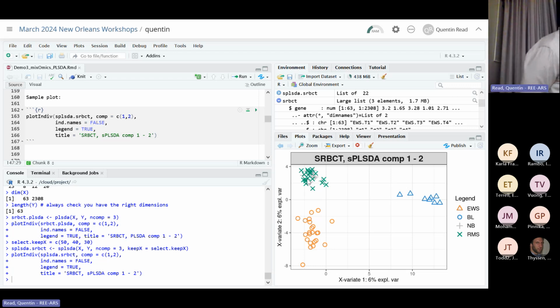Oh, yeah, that's odd. That's true. Yes, it seems like that is a bug in this package. So yeah, that'd be something to file as a bug report. Which one is it, the shapes or the colors? That's right. I'm not sure, but very good to notice that.